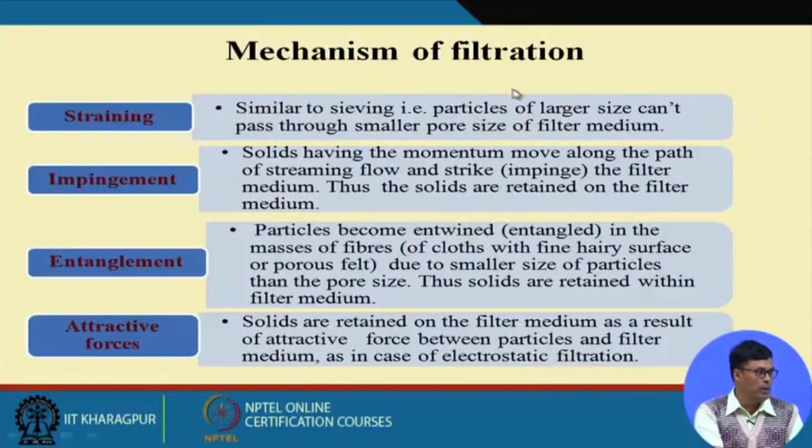Now the mechanisms of filtration are straining, impingement, entanglement, and attractive forces. Straining is similar to sieving, where a particle of large size cannot pass through a smaller opening.